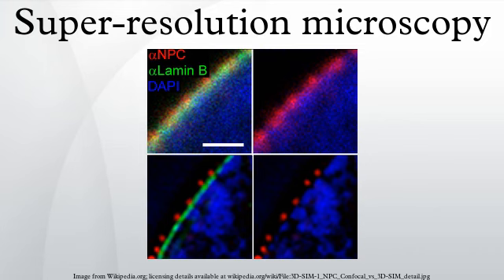In comparison with NSOM and ANSOM, this method does not require any special equipment for tip positioning and has a large field of view and a depth of focus. Due to the large number of scanning sensors, one can get shorter time of image acquisition.